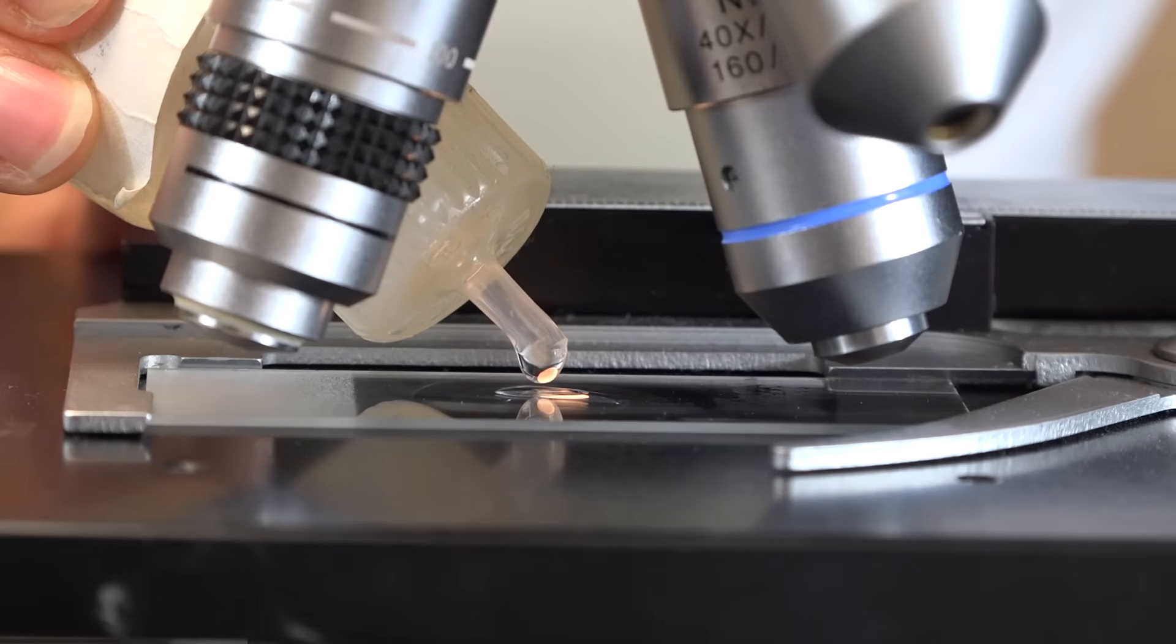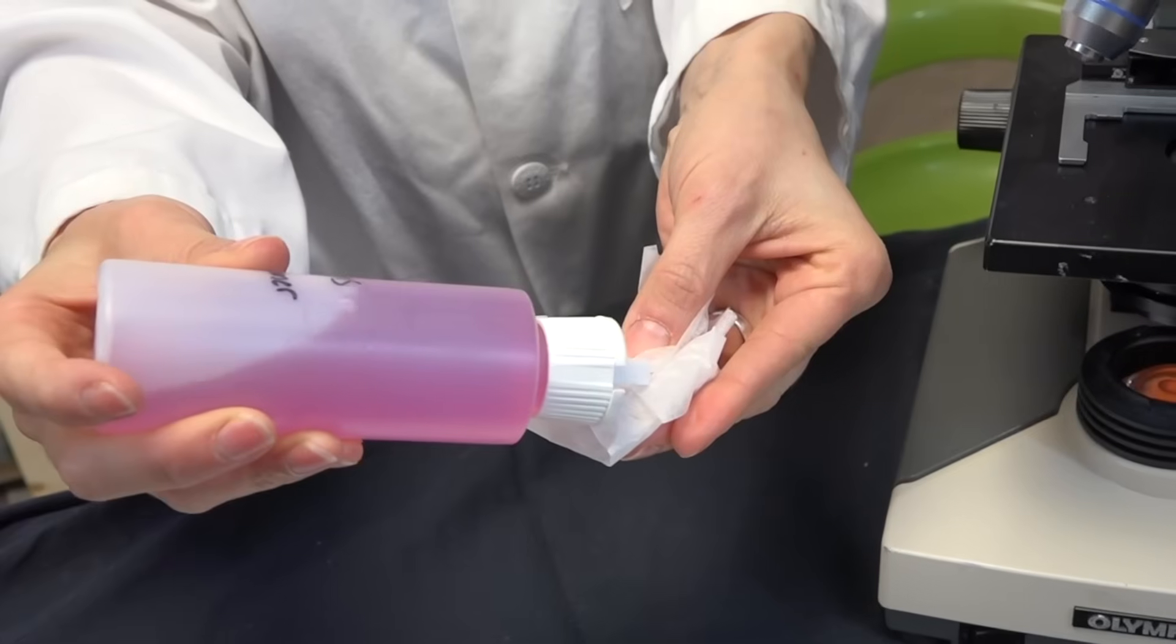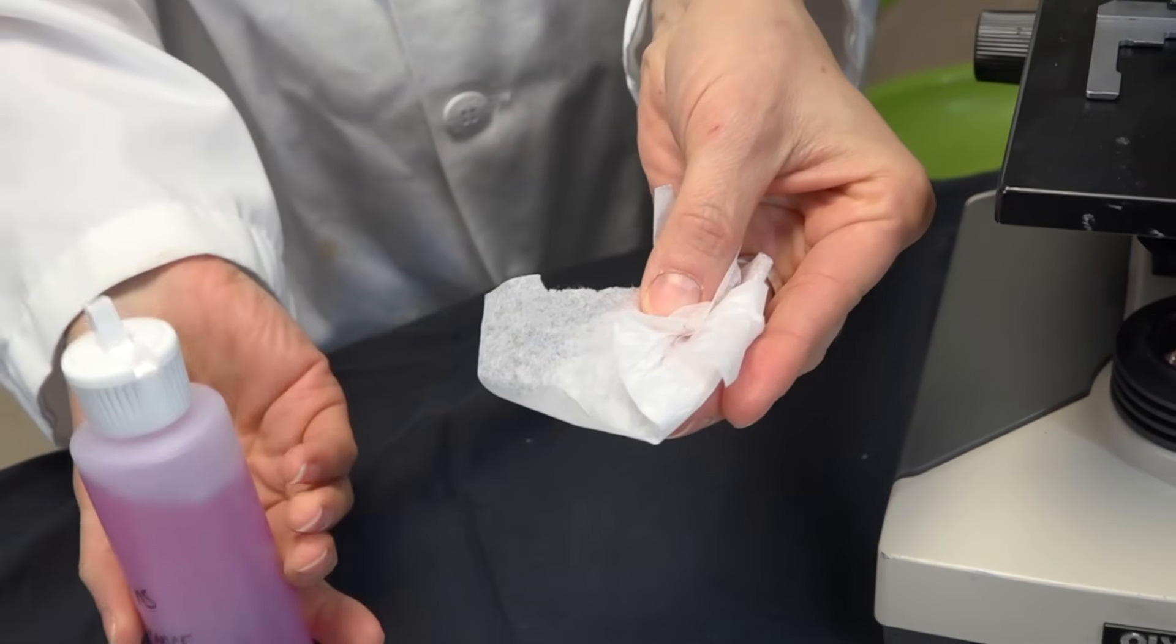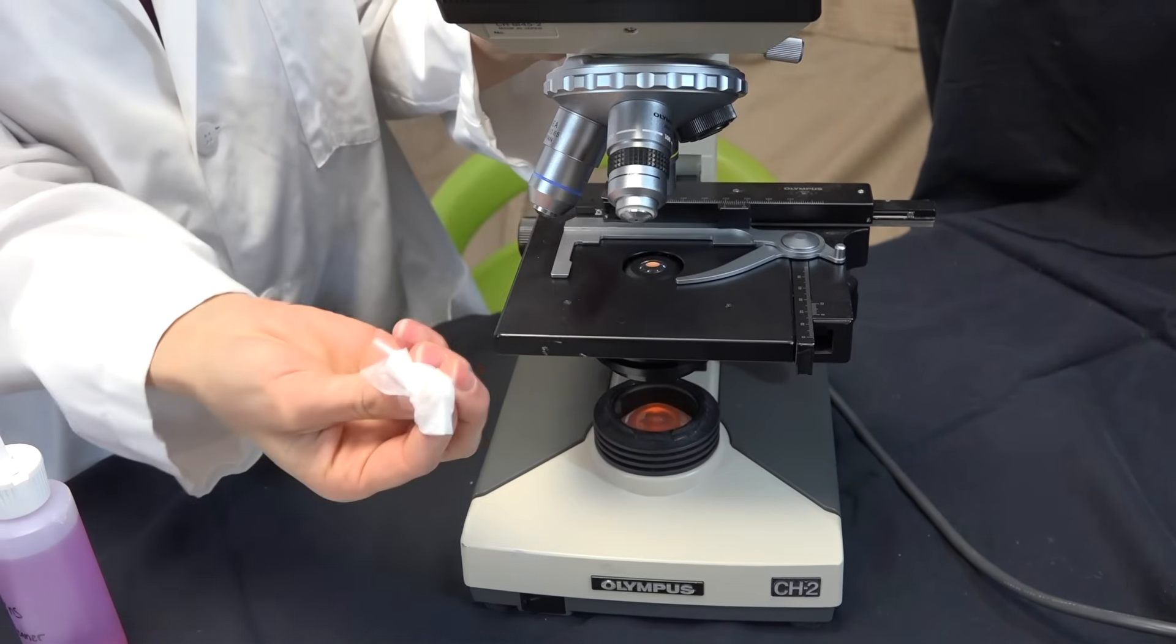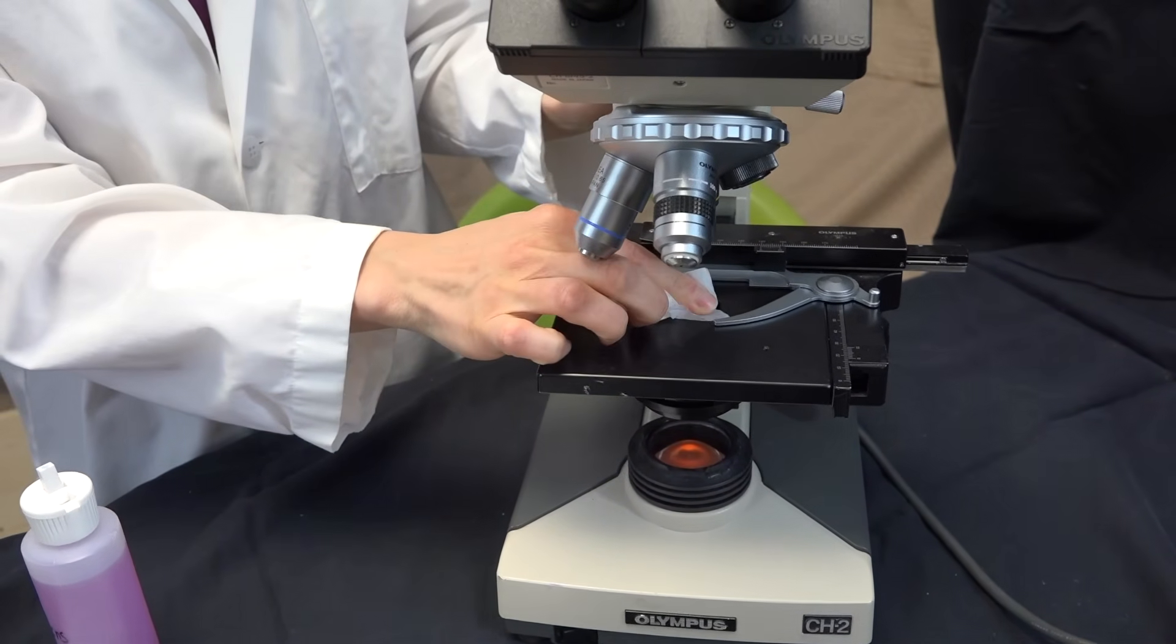If you've used oil on your microscope you want to use lens cleaner to clean off any oil. Just put a couple drops on your paper and rub to remove any oil. If necessary you can also wipe the condenser.